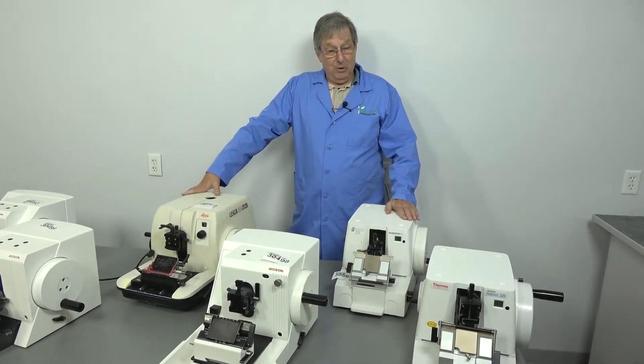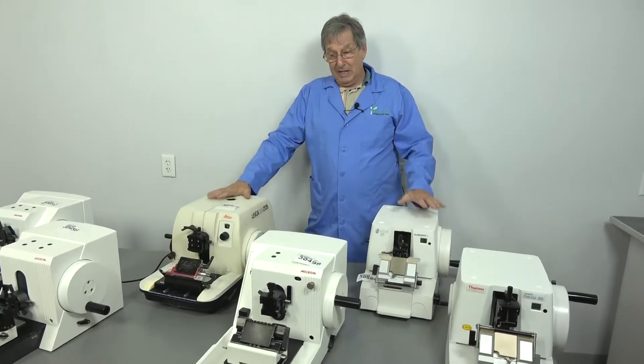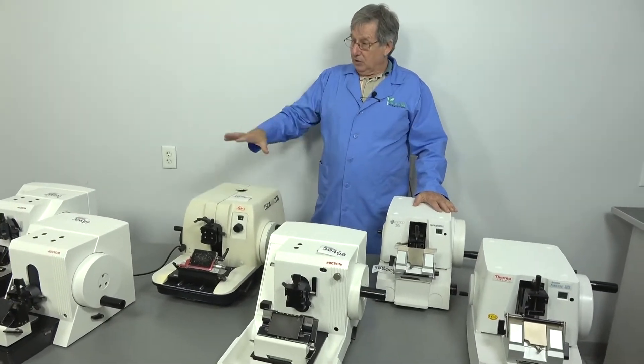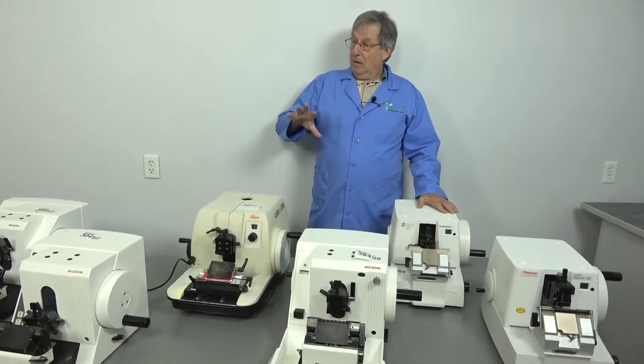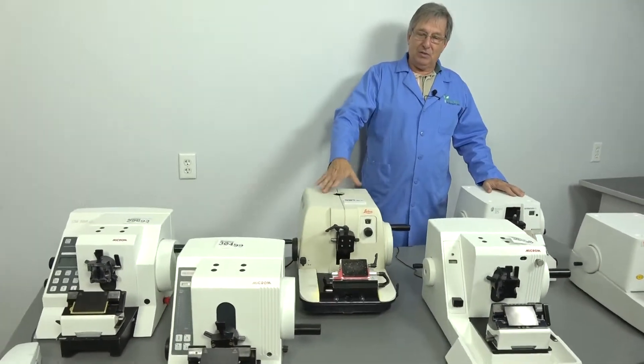Today I want to talk a little bit about microtomes. We just got a slew of them in. Thought you might enjoy seeing the differences and talking about some of the different models and features and what you can expect.